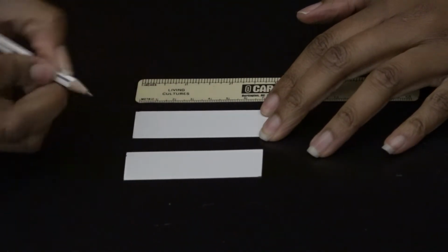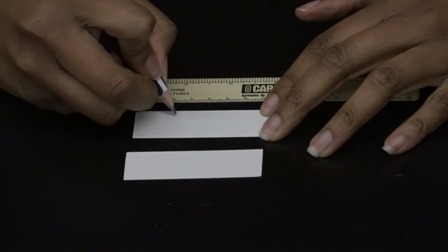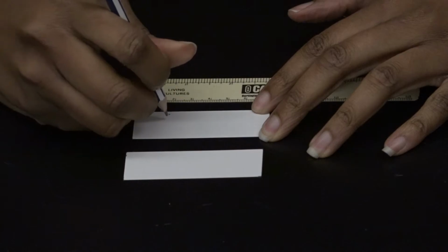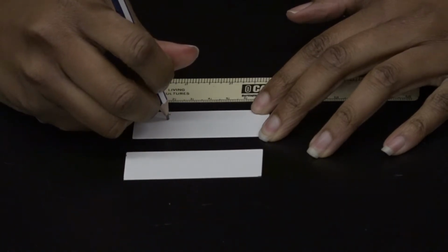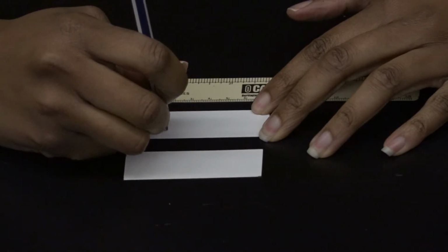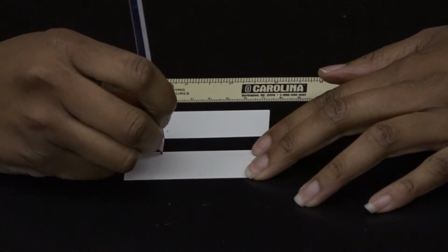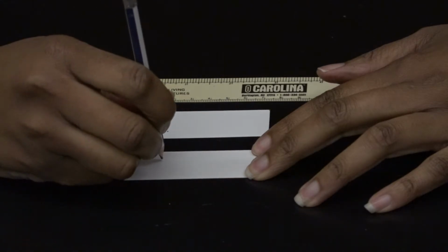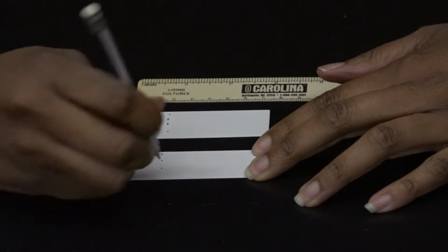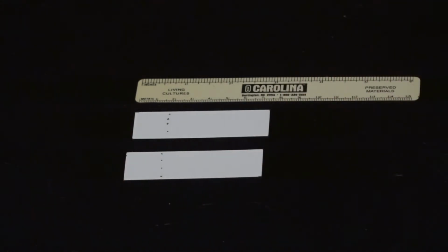And I'm going to put 4 dots, 1 dot corresponding to each of our amino acids. So this will be 1 dot, 2 dots, 3 dots, 4. And over here I'll make them even better spaced. And this is marking where I'm going to put my starting amino acid drop. They still have to travel up the paper. Okay, so there's the dots.